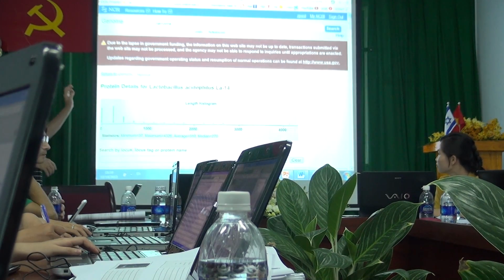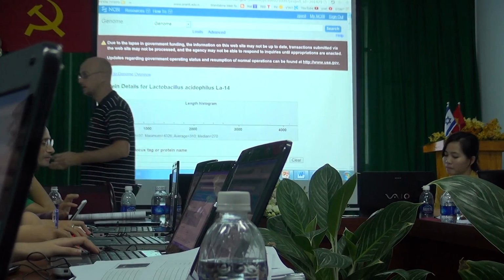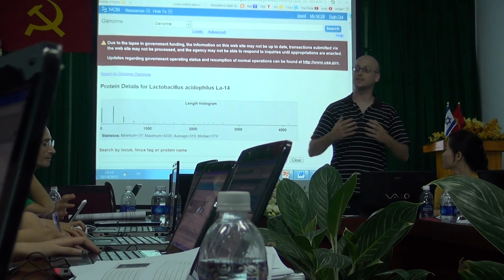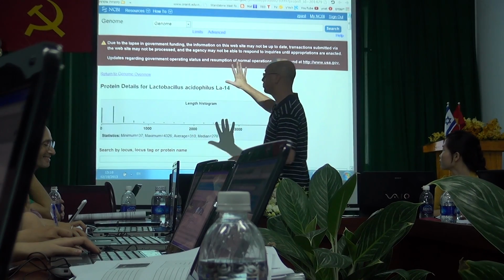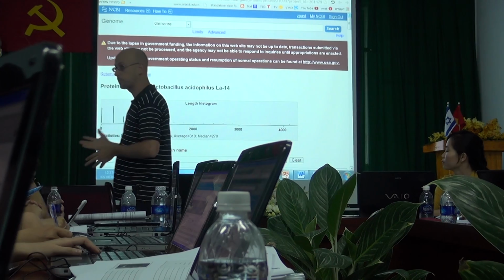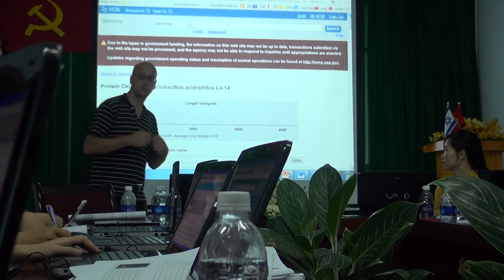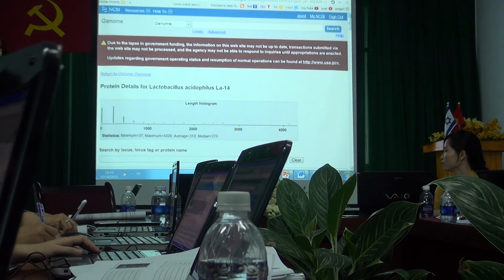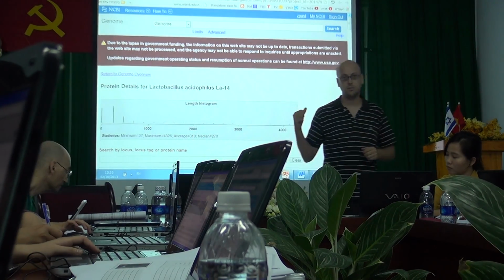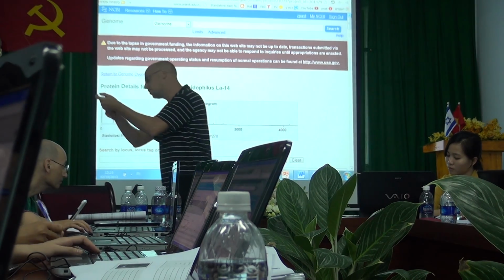And later on, not today but in a few days, we are going to discuss some automatic tools that make this annotation procedure even faster and easier. So there are some tools that take the genomic data, the full genome of a bacterium, for example, and we analyze it with some tools, and these tools look at all the genes and all the proteins that this bacterium has in its genome, and they tell us this bacterium can do lactofermentation, it can do anaerobic respiration, it cannot do nitrogen fixation.